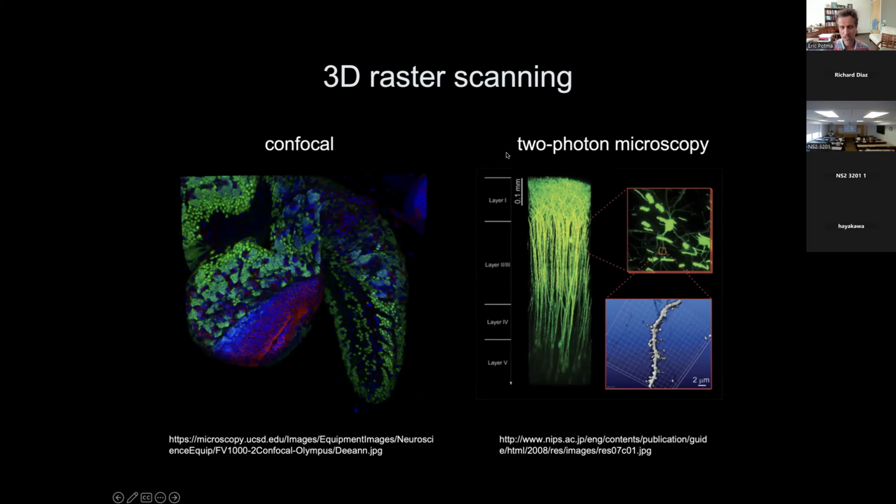And that is one of the reasons, or mostly the reason, why two photon microscopy or three photon microscopy has become superior for tissue imaging applications. So if you do tissue imaging applications, live tissues and so forth, really nobody is using confocal microscopy. It's all nonlinear microscopy based because of these clear advantages.